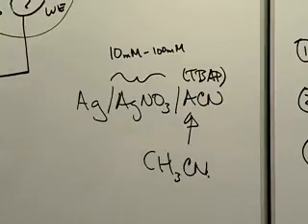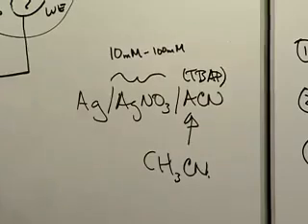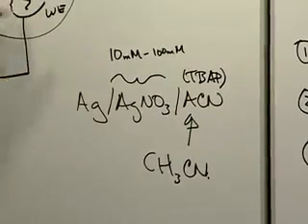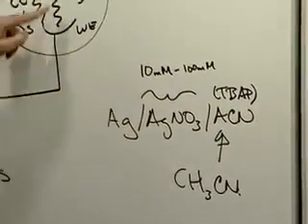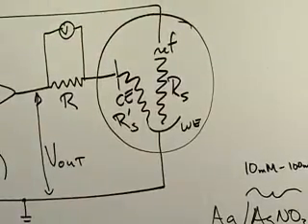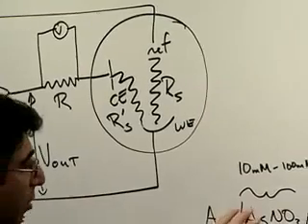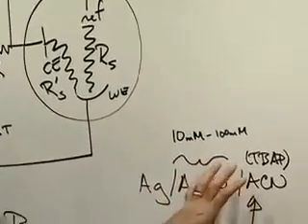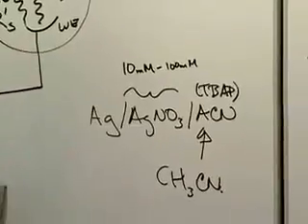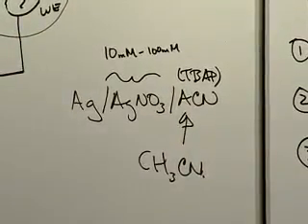Sometimes you need an electrode that either has low resistance, that is, you do not want to have that frit in here, or you need an electrode where you have to be certain that the material in the half cell is totally compatible with whatever you have in your electrolyte.